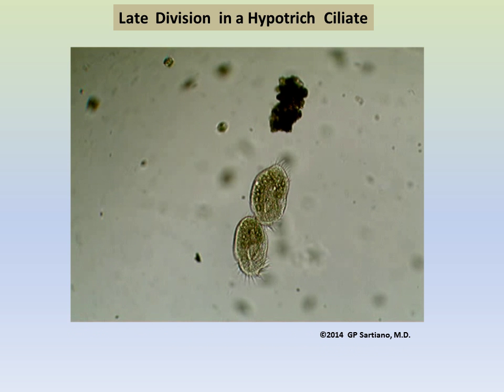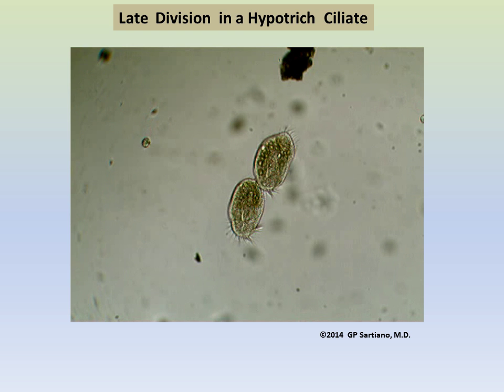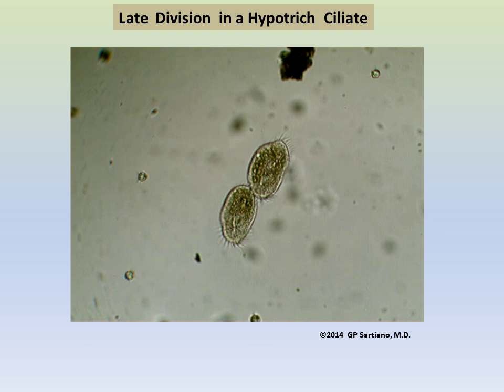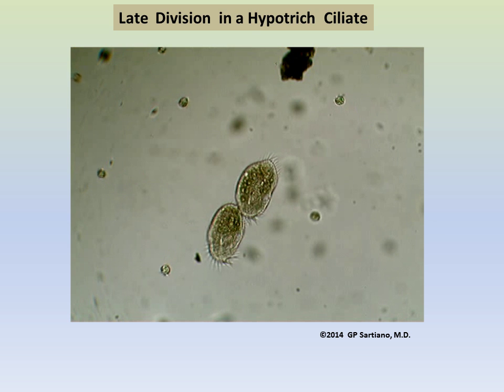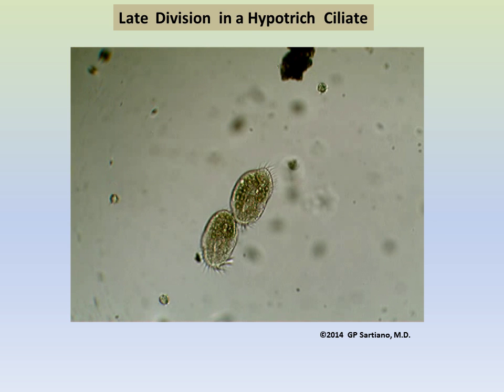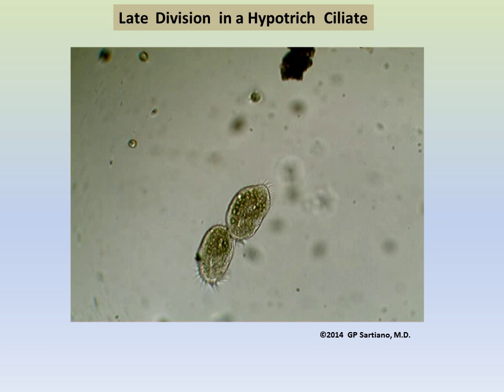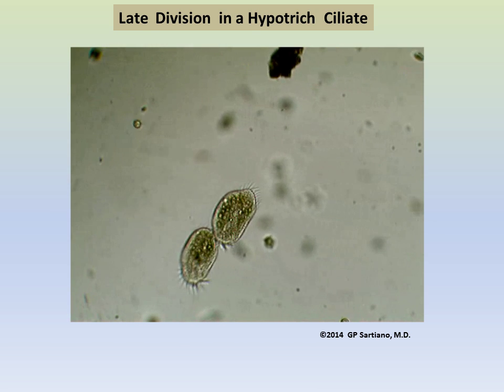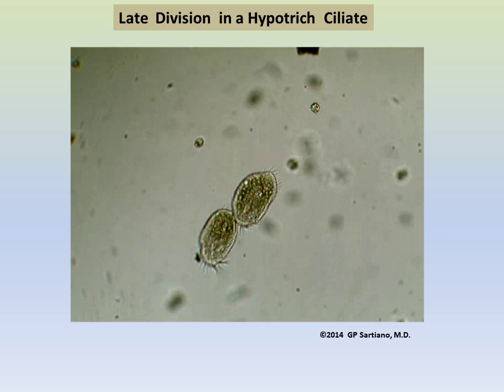The process of completion of development and separation continued unabated for several minutes. The organisms were lost from view, and the actual separation is not visible in this video. Shortly afterwards, one of the two product cells became visible, and it is the subject of the next few slides.